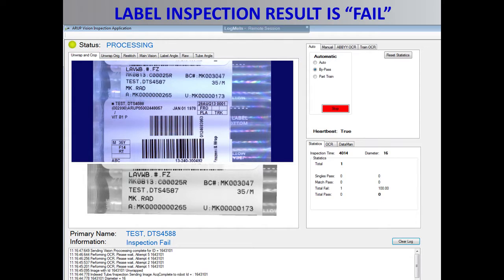This slide shows an example of a fail image. The customer transmitted a patient name 'Test, DTS 4587' and also printed it on their label. In our LIS record, however, we intentionally changed the name to 'Test, DTS 4588.' As expected, the OCR system could not find the matching name and declared the image as a fail. This example illustrates that the OCR system works with both alphabetic and numeric characters.